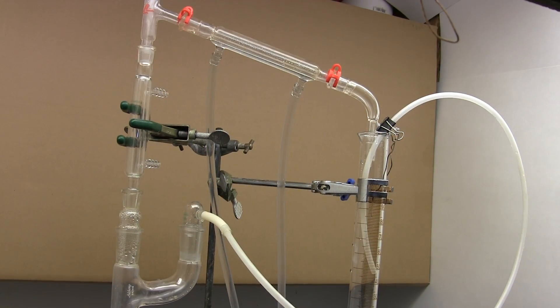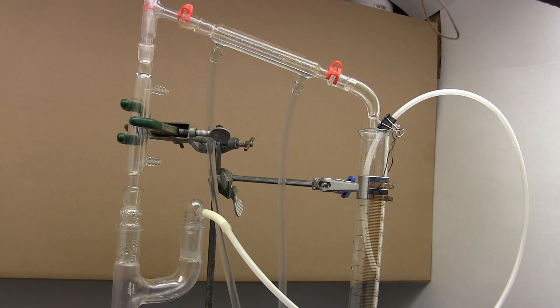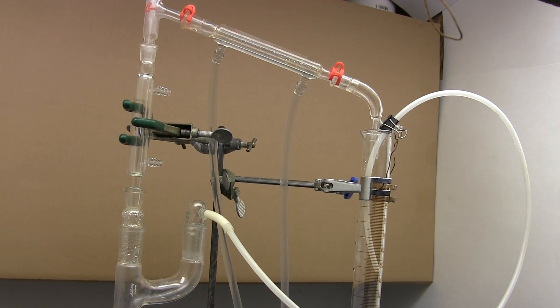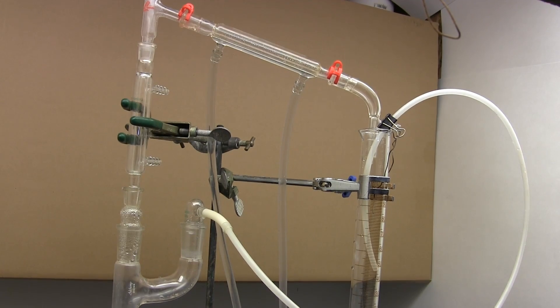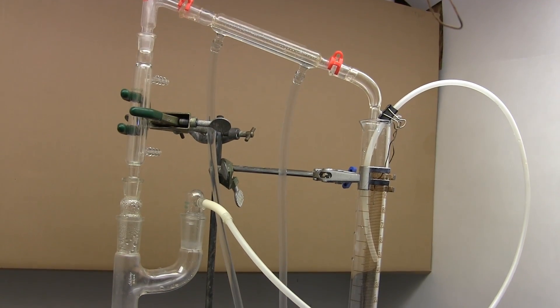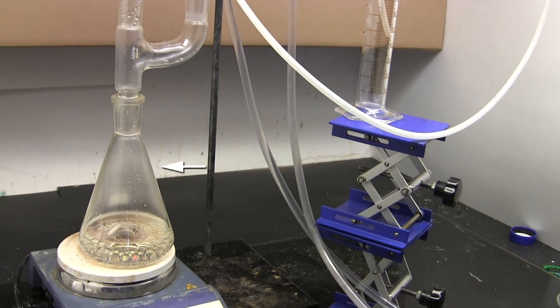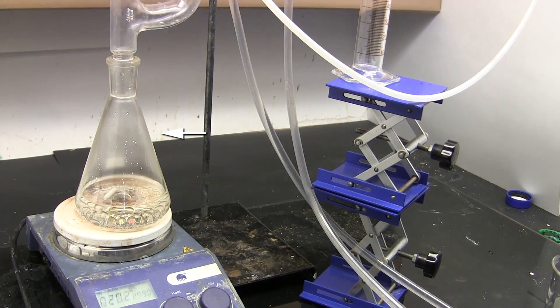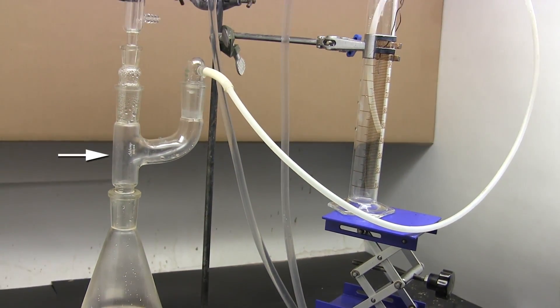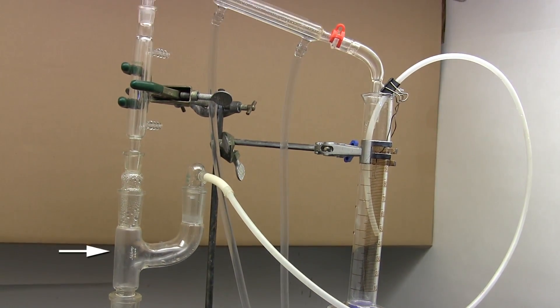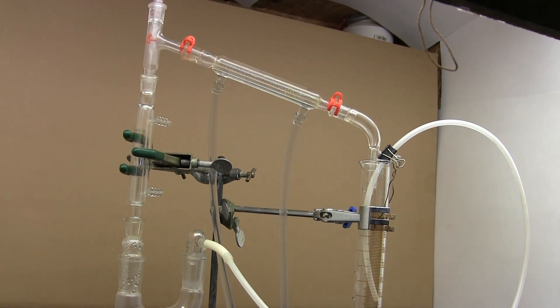And here it is. I know it's a little bit daunting and far more unwieldy than a professional unit but it does the job and it can be put together in ten minutes. Let me walk you through it. Down here is our boiling flask containing our water and toluene test sample. Above that we have the Claisen adapter but you can use a cheaper gas inlet adapter if you have one.